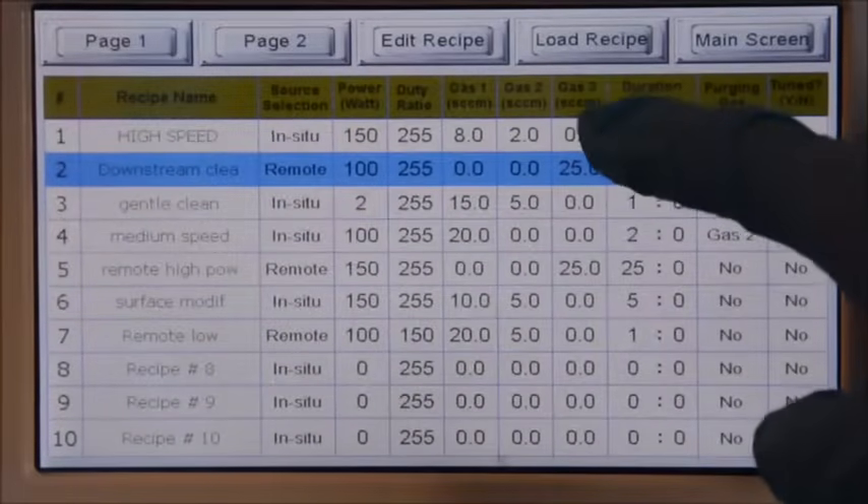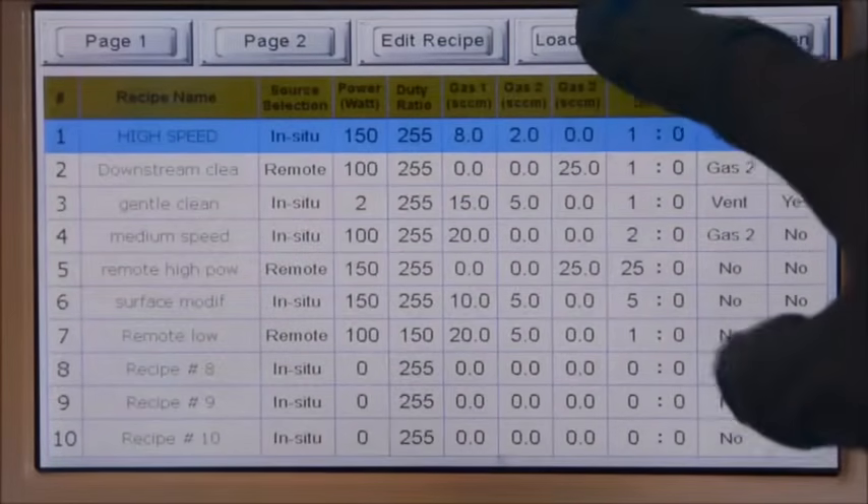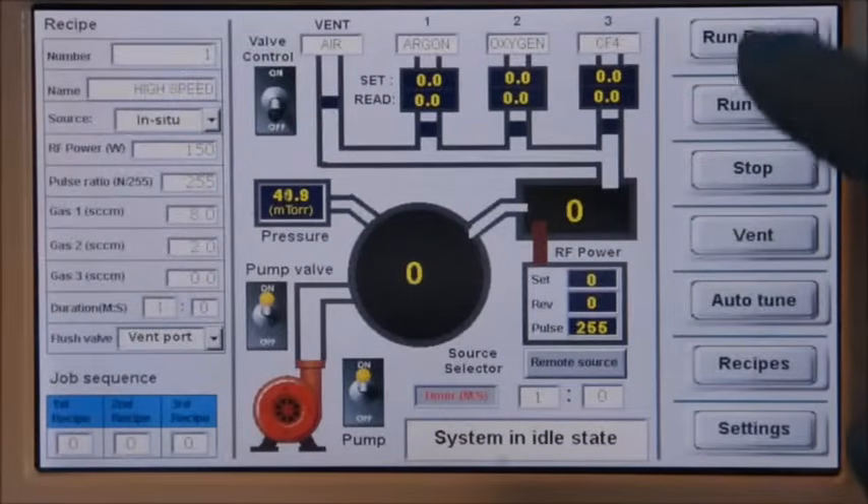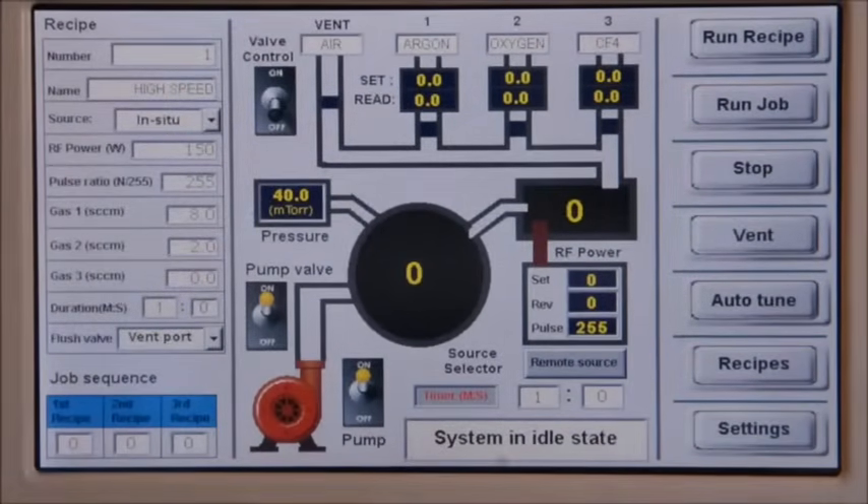Then select the recipe to be executed. Click the load recipe button. The recipe to be executed will be loaded to the main screen.